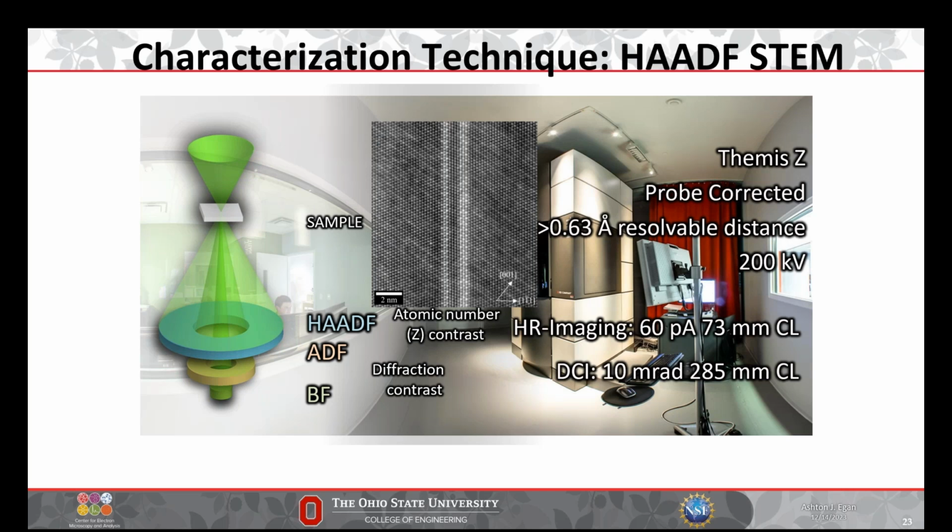But practically, you can do atomic resolution analysis with thicker foils and with higher tilts. It's just you don't get the data quality that you get with thinner samples. So practically, yes, this is very feasible. This is how I do most of my sample prep, and I don't have to tilt very much to get to the zone axis. Most times, I'd say it's easily less than 5 degrees, but it can be much, much less than that.